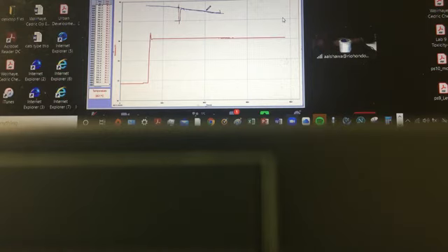So that's why I kept saying it is already decided for you, and it's already occurred at the beginning of the process, and you already missed it. It should be measured at the beginning of the process, which is impossible. How do you measure it? And the process did not kick in. You haven't started the process yet, but you need to measure the final temperature of that process that hasn't started yet. It's kind of awkward, yeah? That would make it impossible to measure. The reason why we have to measure it using software or plotting.